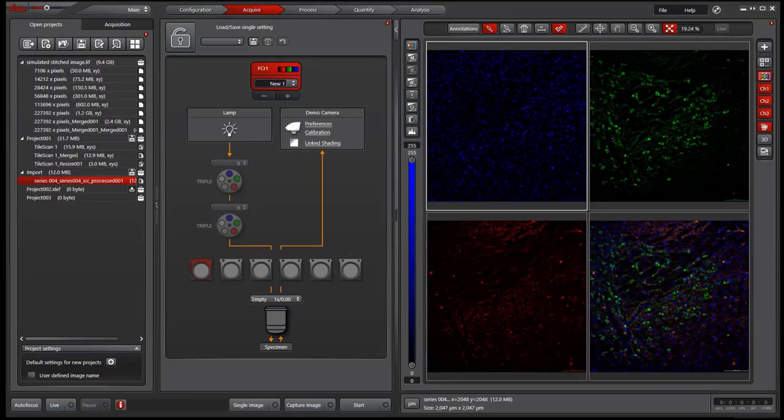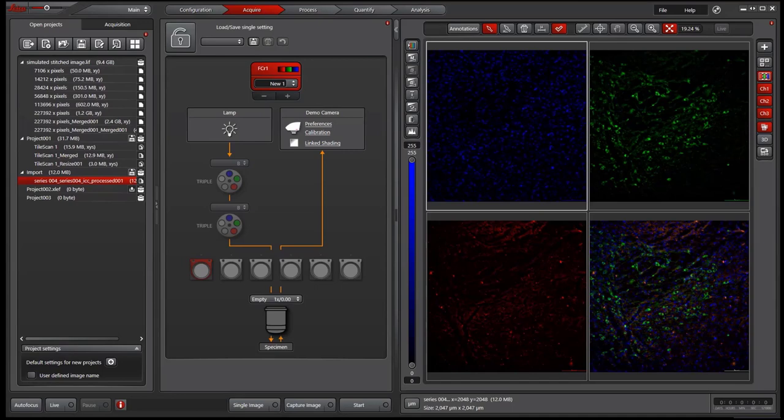Hi there. Today I will talk about how to handle the image files in Leica LSX software. There are two ways to save the images in the software.